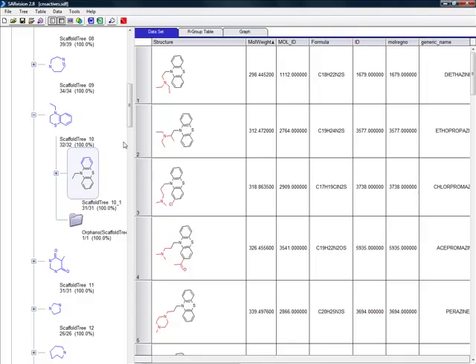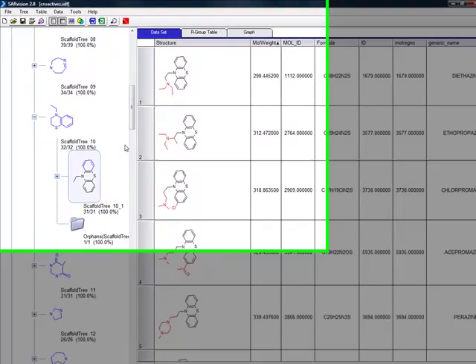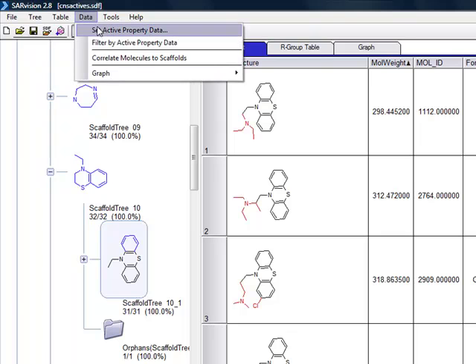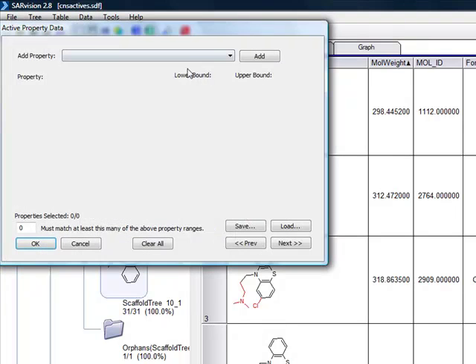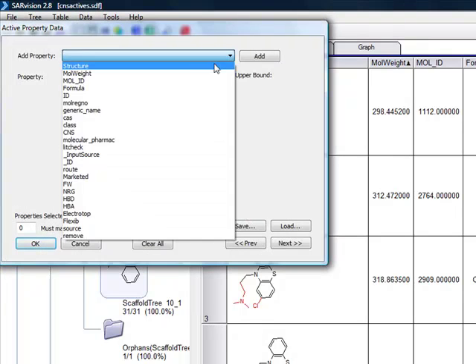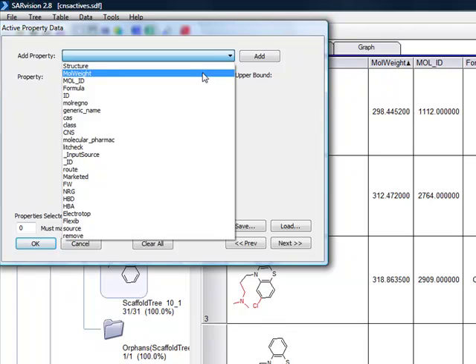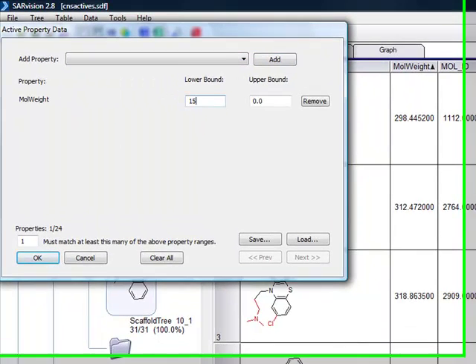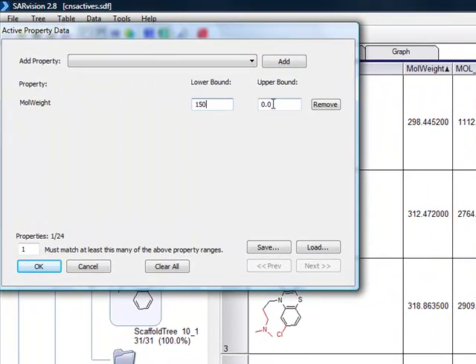If you have biological or physiochemical data for the molecules, you can use the set active property function to filter compounds according to their desired values. At the same time, you can identify the chemotypes that most frequently satisfy the criteria you choose.